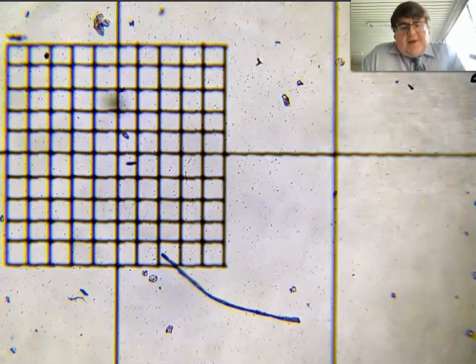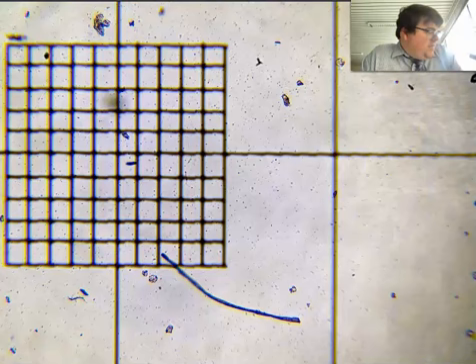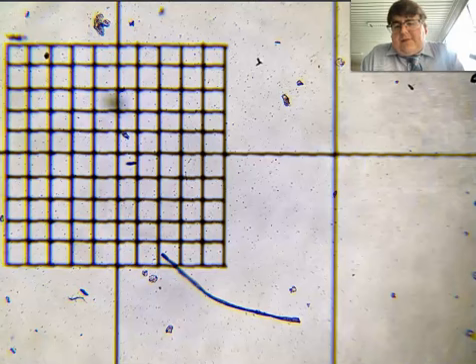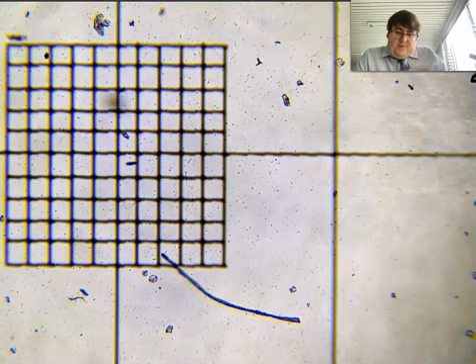With the digital microscope, they have slightly higher magnification than a normal microscope would have that you use in the classroom. So for example, while I'm on the 4x lens here, with the microscope you'd use in class, it's 40 times magnification. It's quite significantly more magnified on this form. So worth knowing that the calculations I do on this video will not be the same as the calculations you do if you're doing it in person in class with a microscope at home.